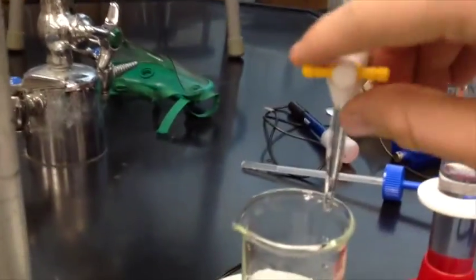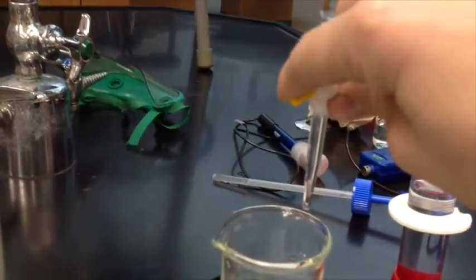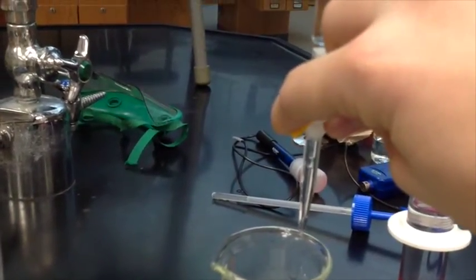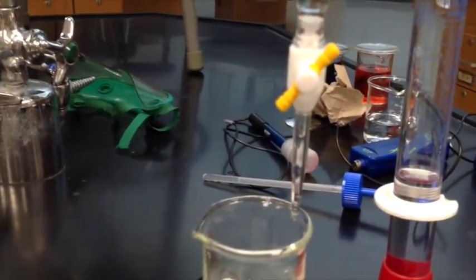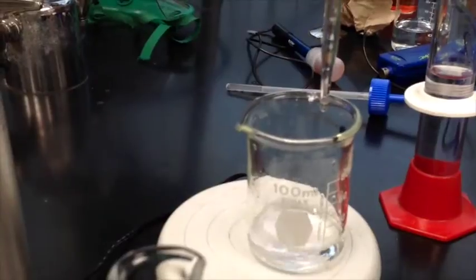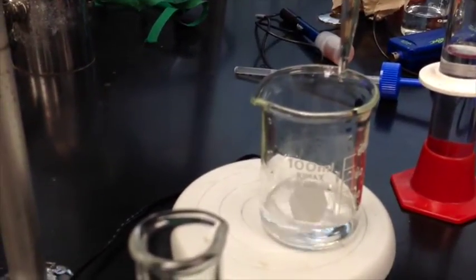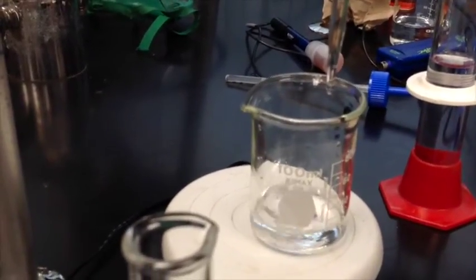And I'm going to turn the stopcock until I get a nice, gentle drip. Something like that, right about there. See it coming, and there we go. Adding dropwise is what a chemist would say. And because this is a long process, I just kind of have to sit here and wait for this to turn purple. It's going to take a while. So for that, I'm going to speed it up.